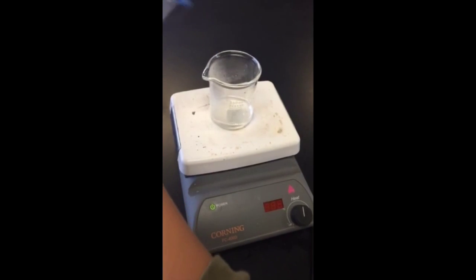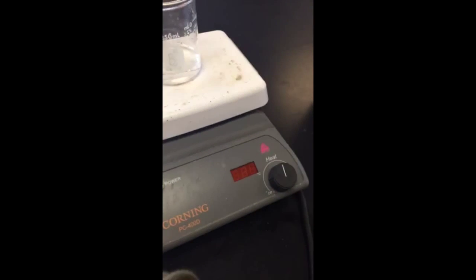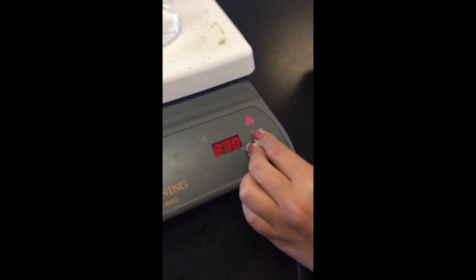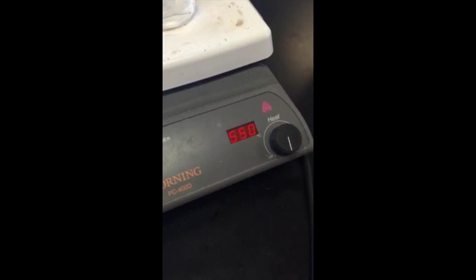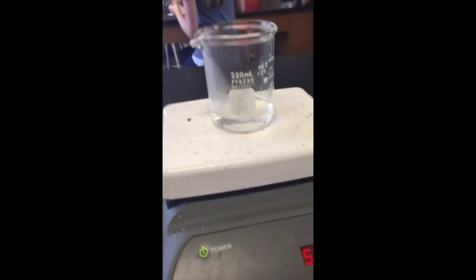The water is all in the beaker right now and we're going to crank up the heat. The heat is at 550 right now and we're going to wait for it to boil.